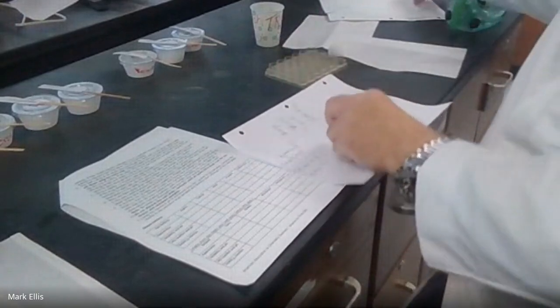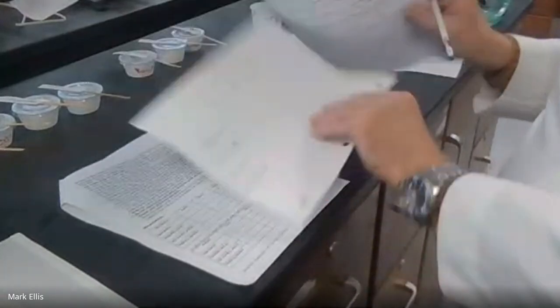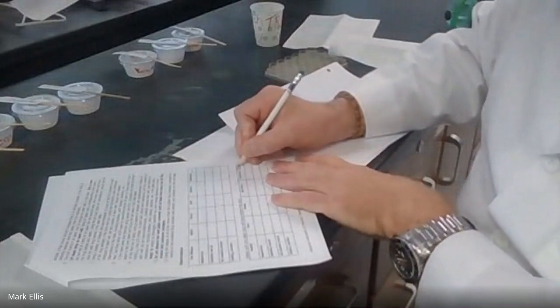And for my pain reliever, there's no prefix. It's just a number. So I got number 1. You definitely need to identify those, especially on here and on the back. So I'm going to go ahead and put that in there. My antacid is A21. My pain reliever was number 1.